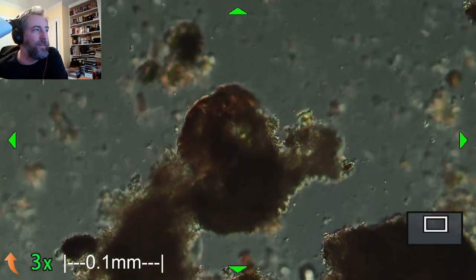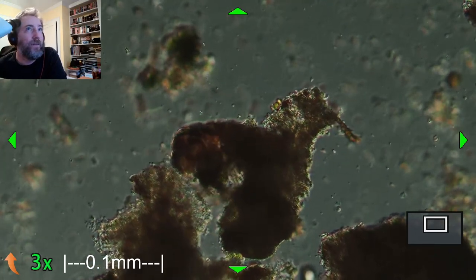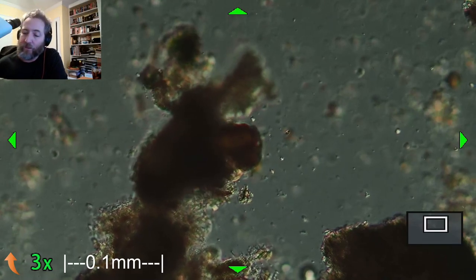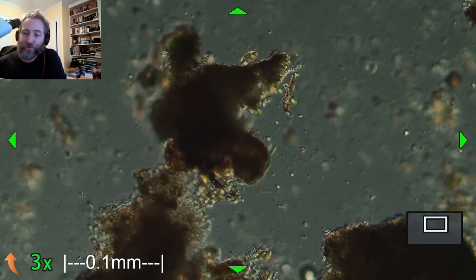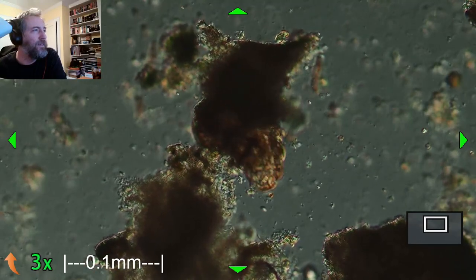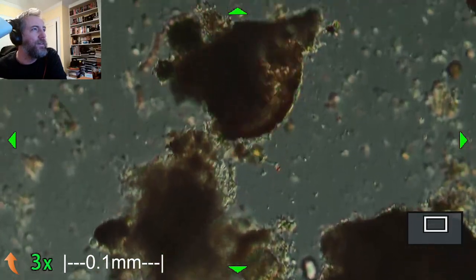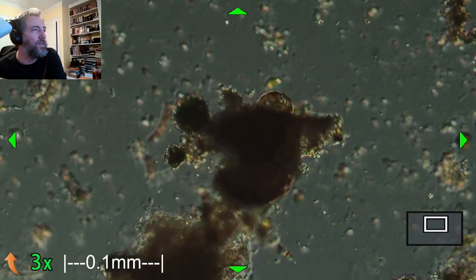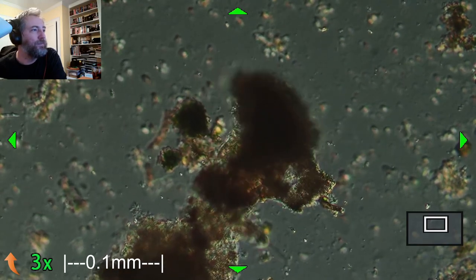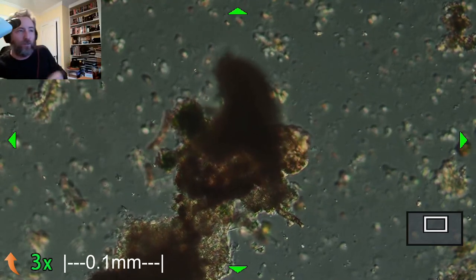Sometimes people just do that with filters, right? To try to get at the color corrections or the color combinations. A lot of times for microscopes, people will use just filters either inside the microscope or put some filter in a level somewhere in between the light and the objective. And some organisms seem to look a little bit better in green light, for example. This one's got like a neutral density filter in the body to try to change the quality of the light that comes in.